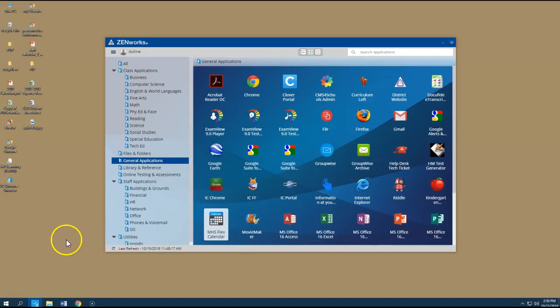Okay, this should be the last little helpful tutorial on how to use the Motic microscope camera. I'm going to end with what to do with your pictures after you've taken them, how to put measurements on them, and how to save them, how to export them, and how to eventually insert them into a Google Doc that can be then turned in as a lab report.